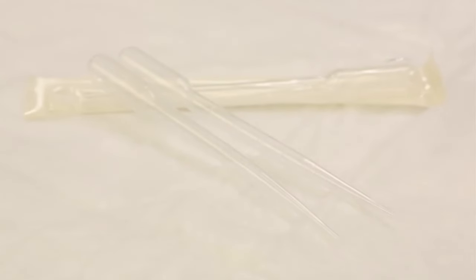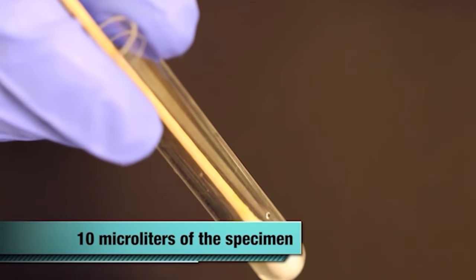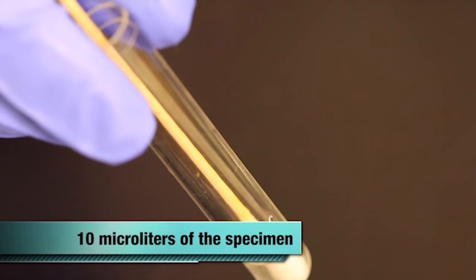To begin the procedure, use a sterile pipette to remove one drop or 10 microliters of the specimen from the collection tube. Place the drop on a sterile labeled microscope slide. Carefully place a cover slip over the drop of the specimen on the slide.